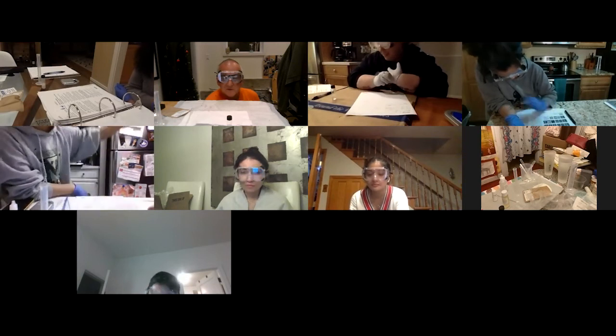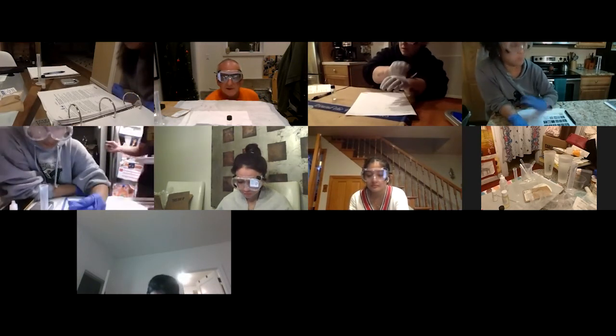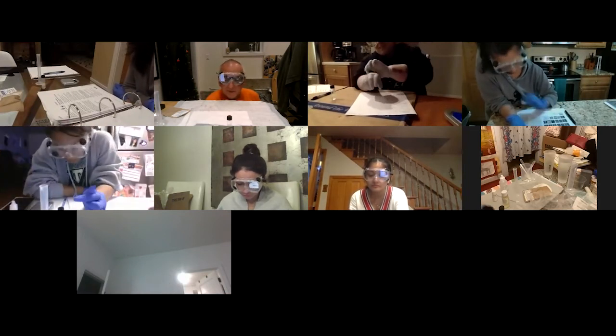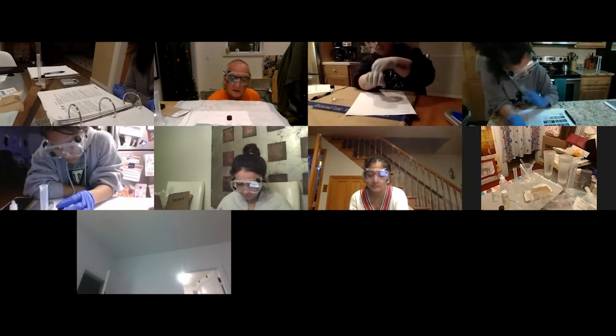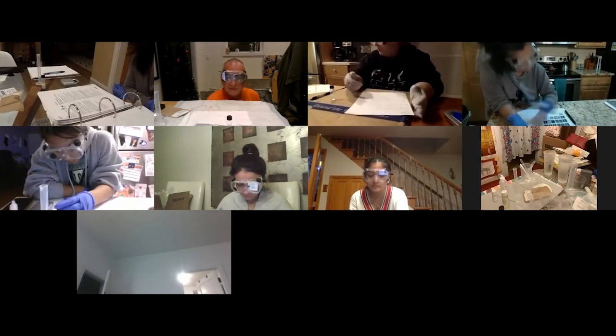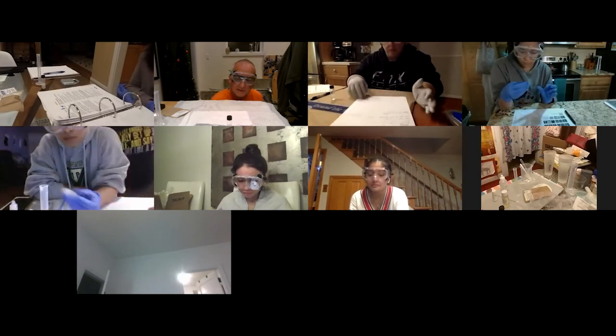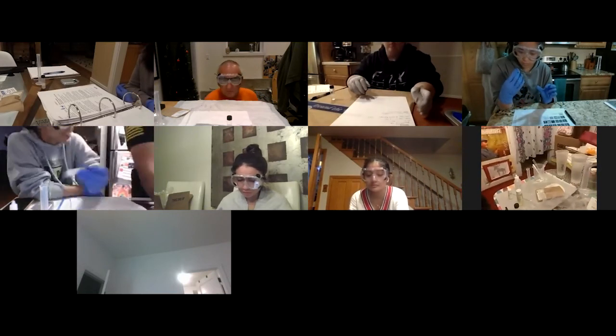Since I haven't done this one before, I don't really know what to expect. I've made salad dressing before. I sort of know what to expect there, but that's a weak acid, so it wouldn't be strong enough acid to break the bonds in the oils.